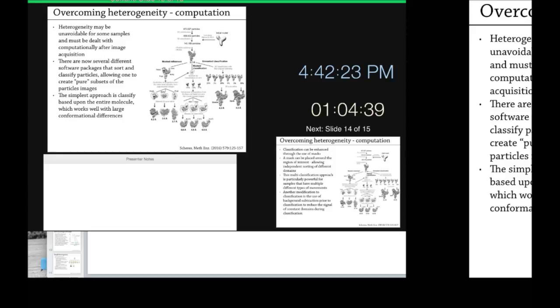And so this is an area where, because picking algorithms aren't perfect, it can be helpful to try to reprocess it, have someone else do it, and see if they end up with similar conclusions. That's really cumbersome and takes a lot of time, so I don't think anyone's willing to do that yet. But as the techniques get more and more advanced, hopefully the picking algorithms will get better and there will be less bias introduced.